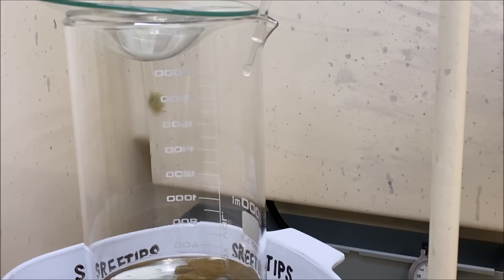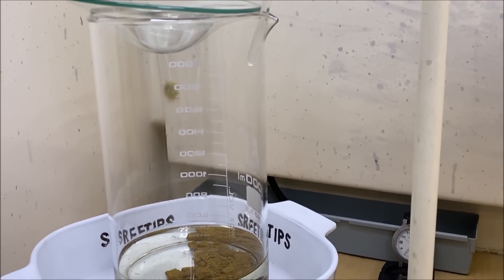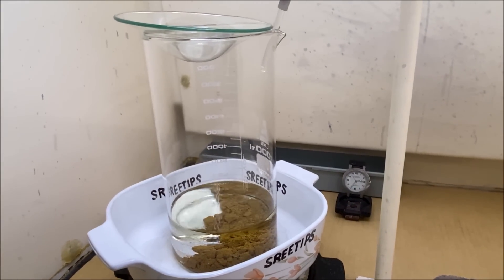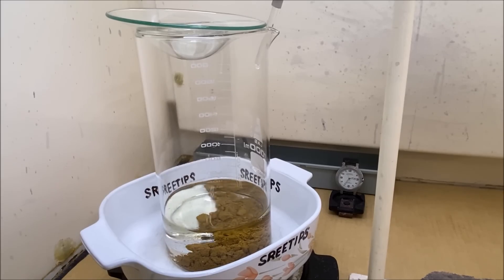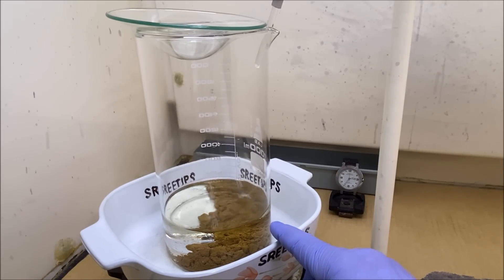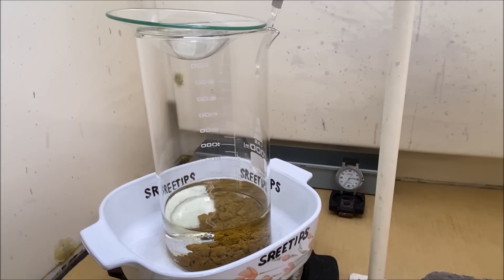Here you can see I'm dripping the hydrogen peroxide very slowly down into the acid-gold mixture in the beaker. What we'll do now is put this on time-lapse and dissolve this gold. We're going to use this dissolved gold as the electrolyte for the electrolytic gold refining cell.